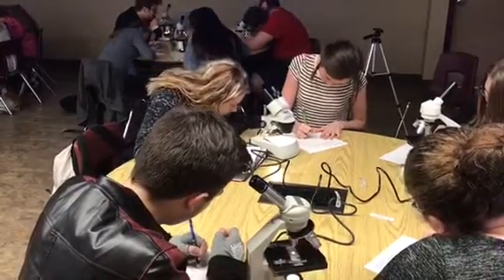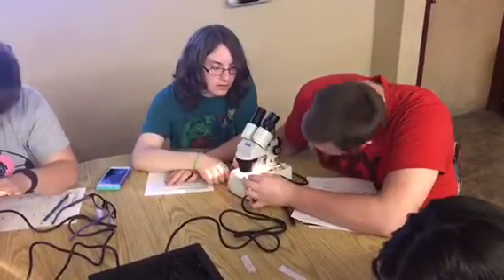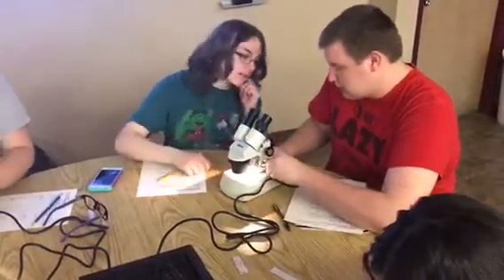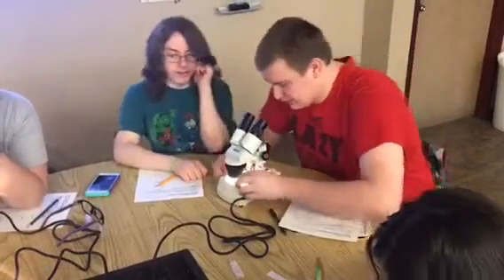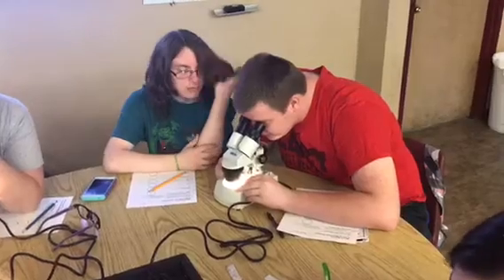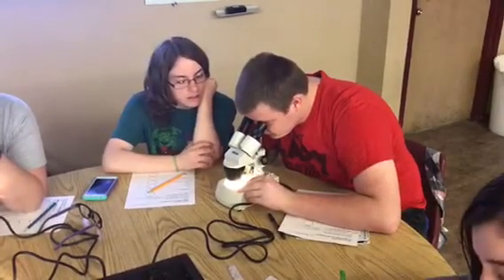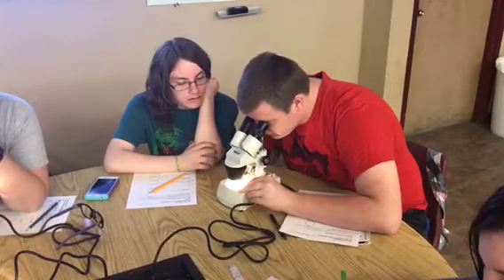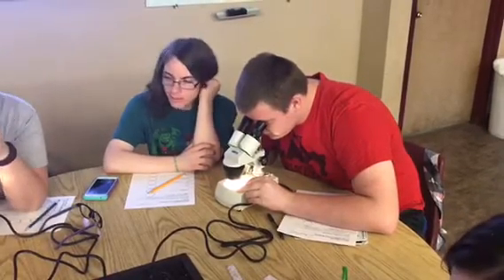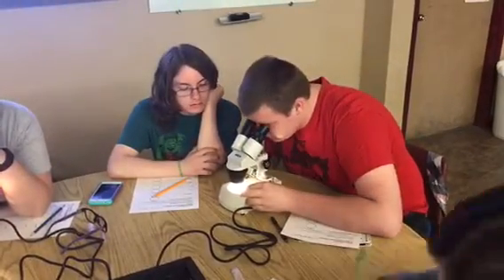Remember, make sure you're writing down observations. There's 2. You flip it. Oh, okay, there we go. We're supposed to draw it underneath. Be careful on some of these because they do get hot enough to burn if you touch. I thought she said you could draw it under both.